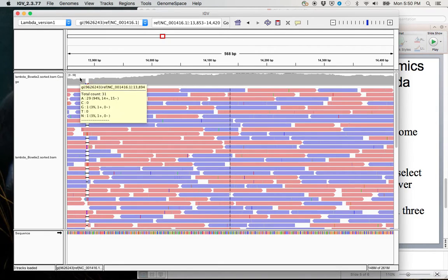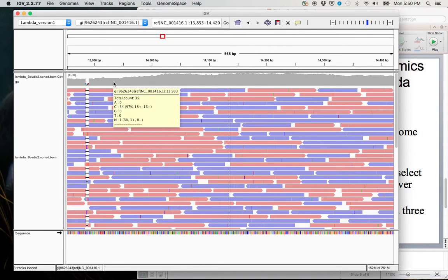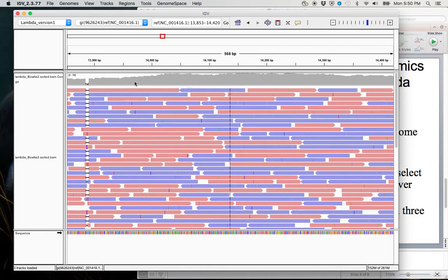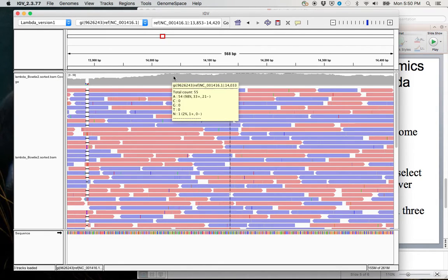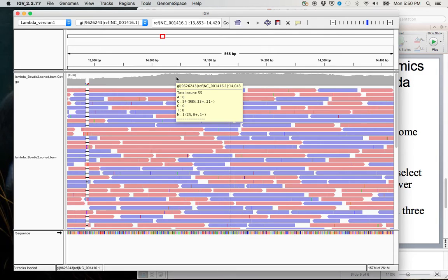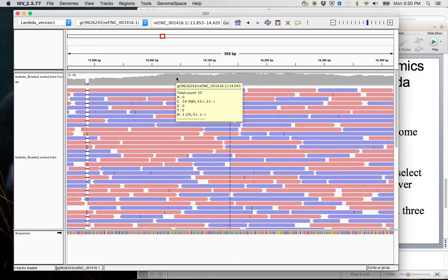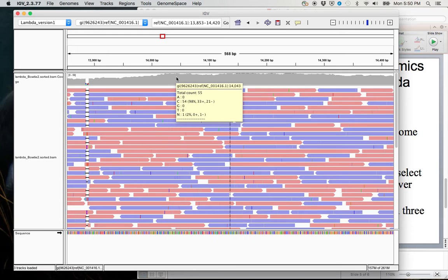So what you see here is at the top, this is the coverage histogram. So that at every position, you have a count of how many reads. So for this position, there are a total of 55 reads. And 98% of them, or 54 out of the 55, have a C at this position. And one read, or 2% of them, has an N. So an N is an unread base, or essentially a sequencing artifact or error.